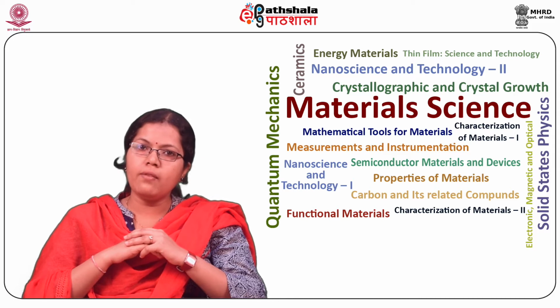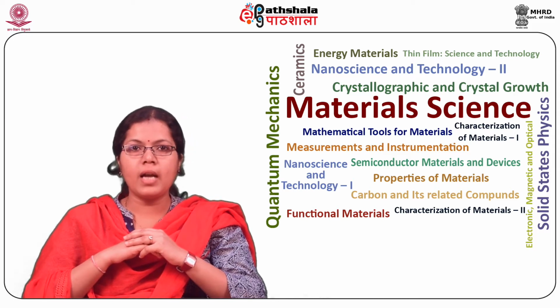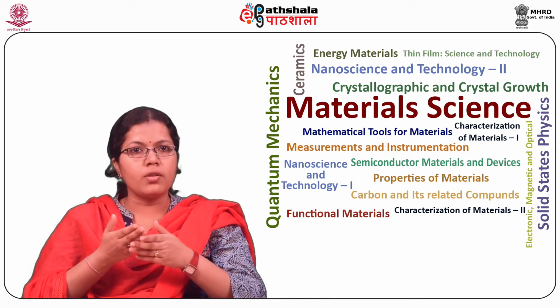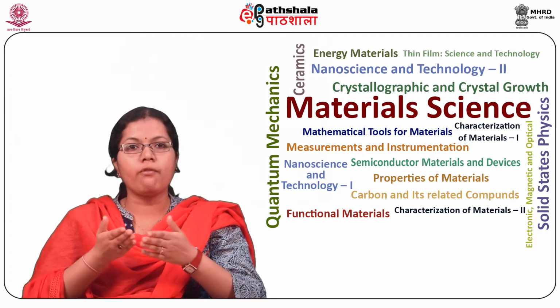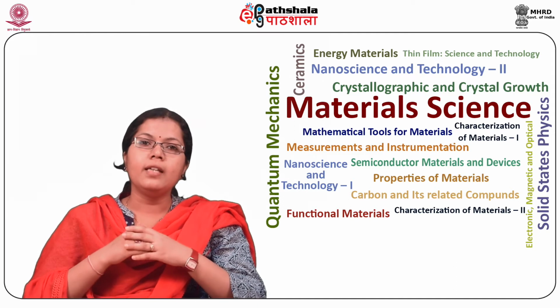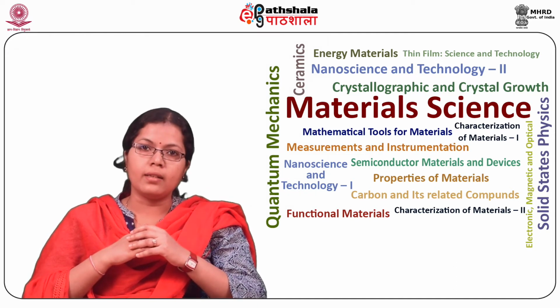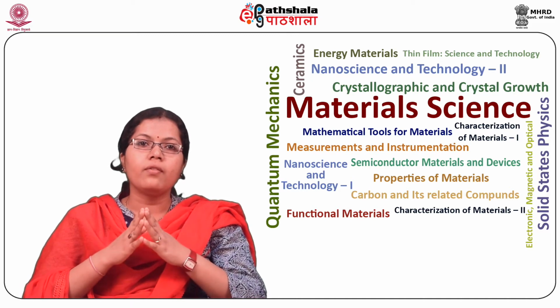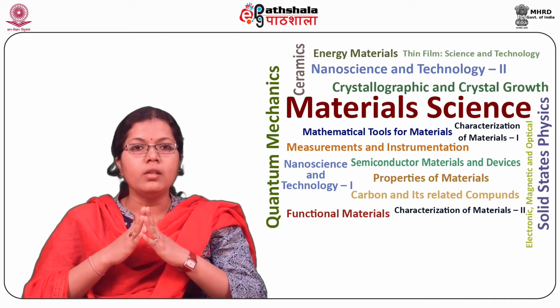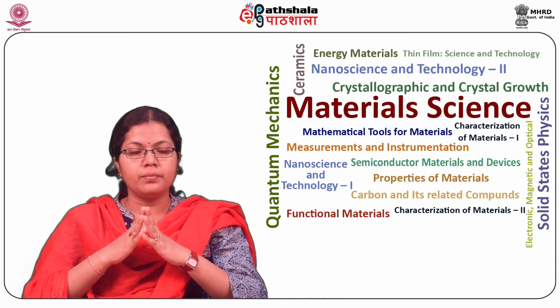The information available may broadly be summarized as morphology, that is, the size, shape, and distribution of phases, and their relationship to one another, with high resolution images varying from micrometer to nanometer level.